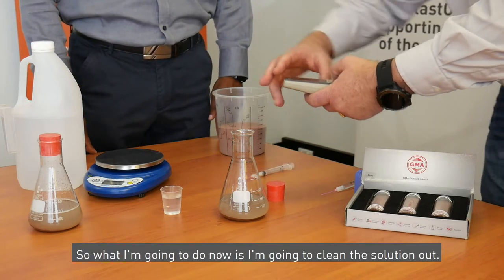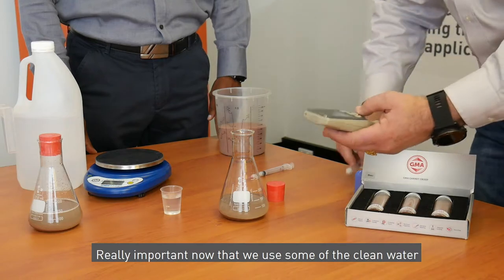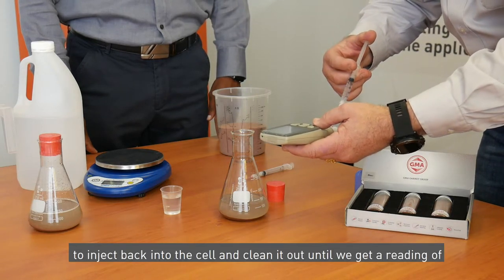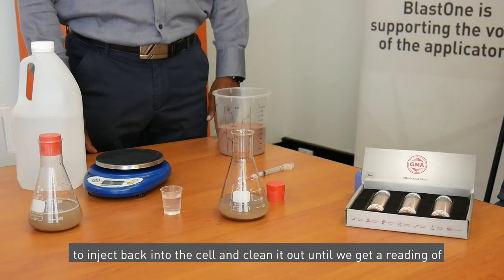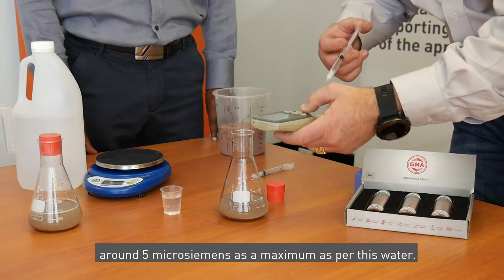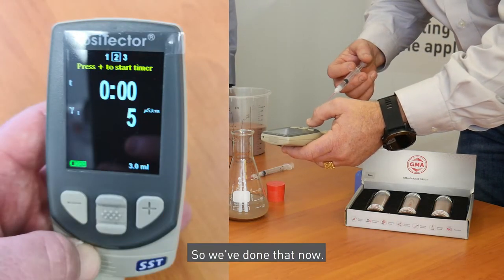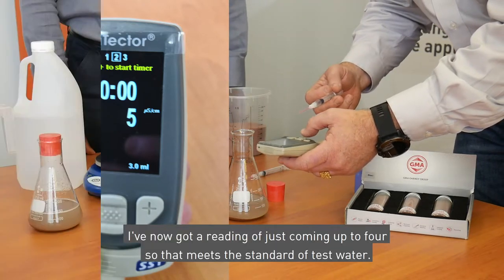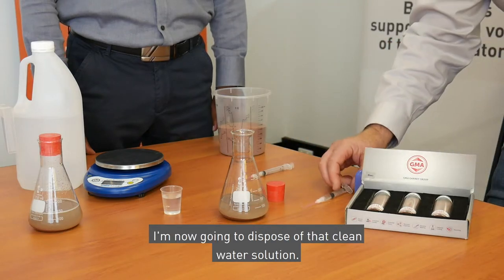So what I'm going to do now is clean the solution out. It's really important that we use some of the clean water to inject back into the cell and clean it out until we get a reading of around five microsiemens as a maximum, as per this water. We've done that — I've now got a reading of just coming up to four, so that meets the standard of test water. I'm now going to dispose of that clean water solution.